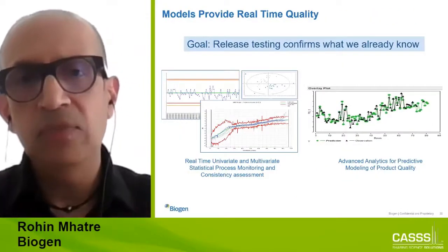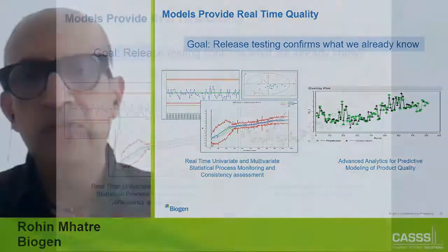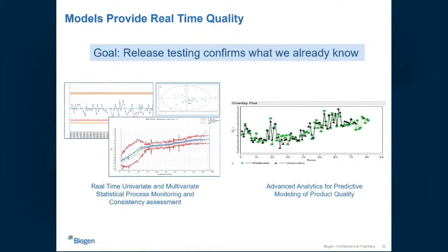This is, again, I won't spend so much time on this. This is just giving you a generic picture of what the outputs are on the production floor. In this particular case, you have your operating limits, what we have seen historically, how a certain product quality changes over the course of production. And this is then looking at what the predictive modeling shows us, what the actual modeling shows us. The correlations are really very good.